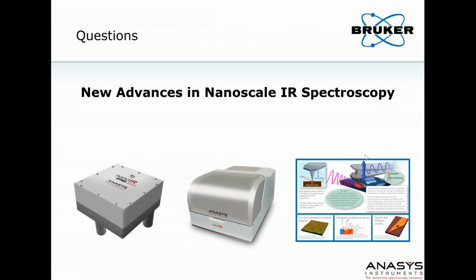We actually have a probe that we're testing to be able to switch between AFM-IR and scattering SNOM, so you're measuring the same location on the sample, and you can look at the reflective and absorptive components that the two modes give you.